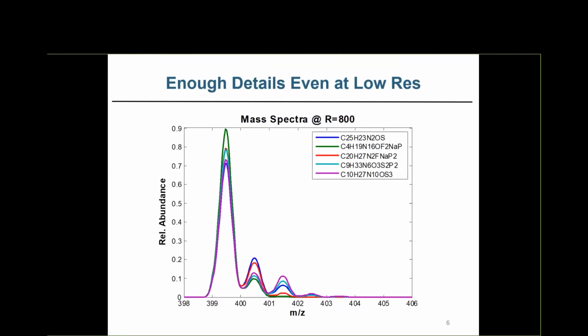But the other piece of information that's a little bit underutilized, in fact, I would say a lot underutilized, is that we also know the isotope distributions in nature. So even if compounds have very similar mass positions, they can have very unique isotope patterns, and this is the fundamental metric that we're going to use, which we'll call spectral accuracy, and we'll talk about that.